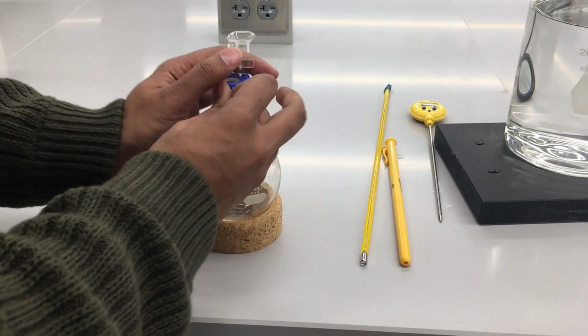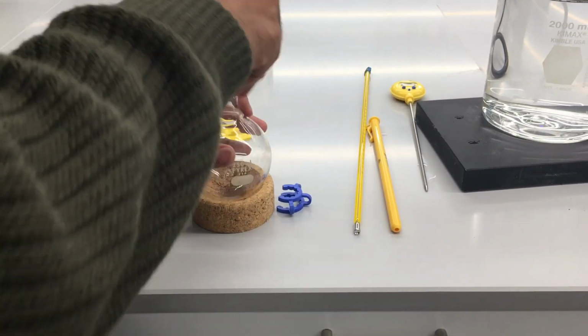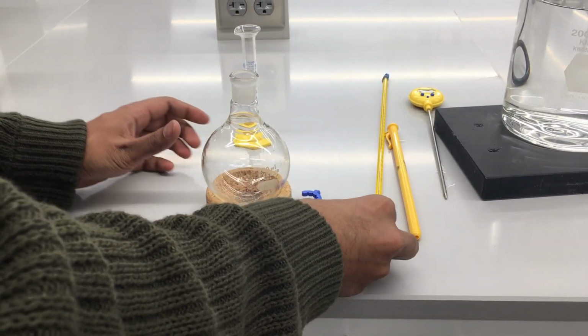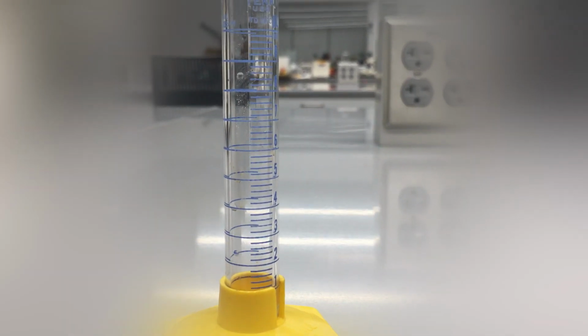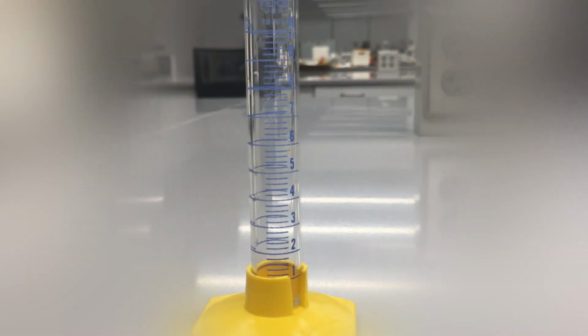All right, so now that I've cleaned and dried the flask, I'm just going to weigh it again to get a new initial weight without the volatile compound. And I'm going to do that whole thing again.